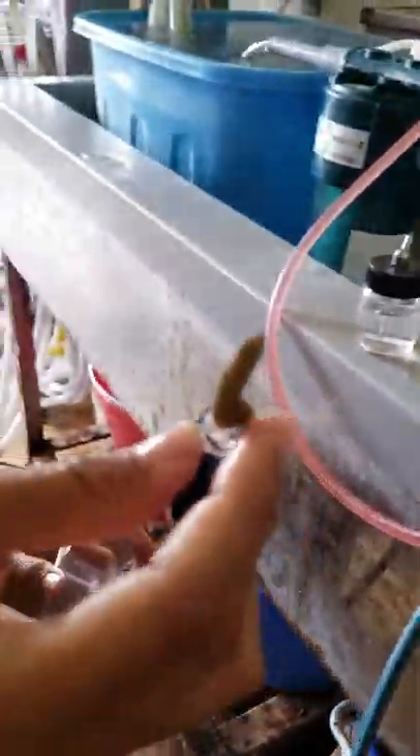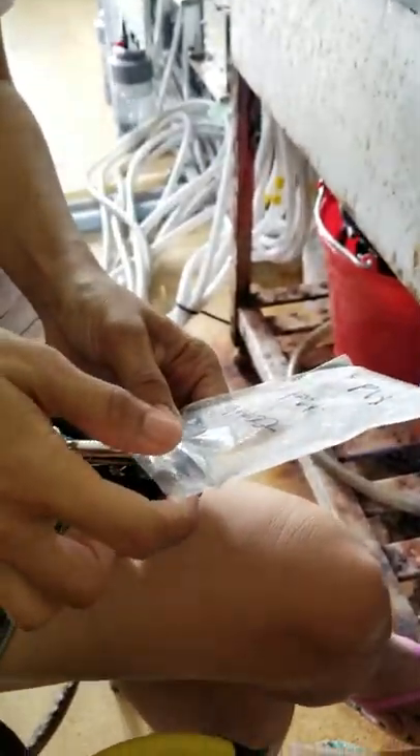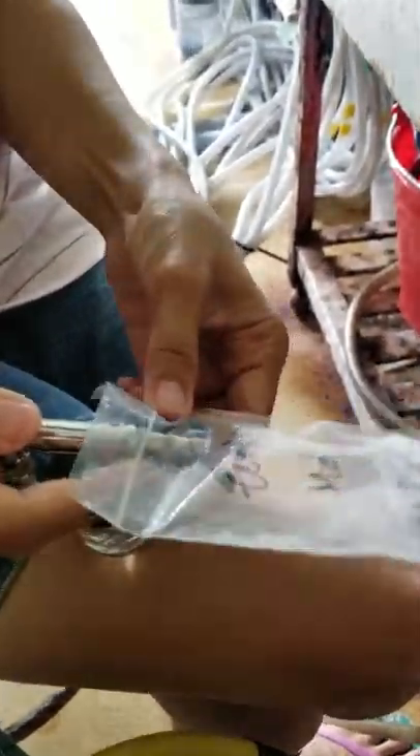We are going to remove this coral tissue. This is the Montipora Digitata and then we put it in the plastic rack. We are going to use this airbrush — this is very fast, I think faster than a water pik, so let's use it.